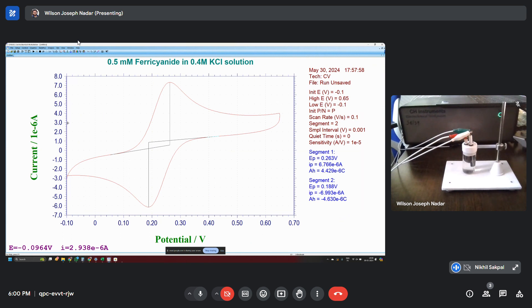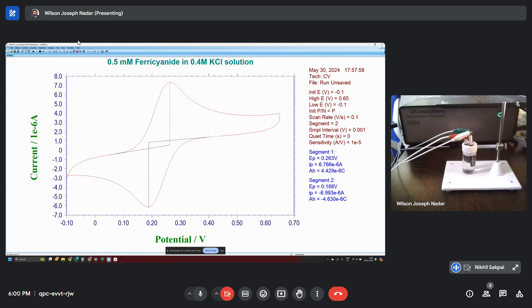We represent CH Instruments Electrochemical Analyzer all over Indian research market. Today I am here to show you the macro program used to run different techniques.